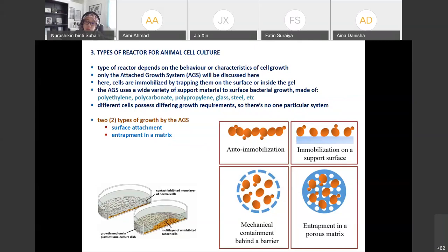Compared to, let's say, bacteria fermentation, which is so easy because you just take out the samples, the culture, and you measure the absorbance. Of course, you have to monitor throughout the fermentation period in order to monitor the cell growth. But this one depends on the reactor for this system. Perhaps, I'm not really familiar with animal cell biology, perhaps you have to sample the whole matrix and get the cells, right?